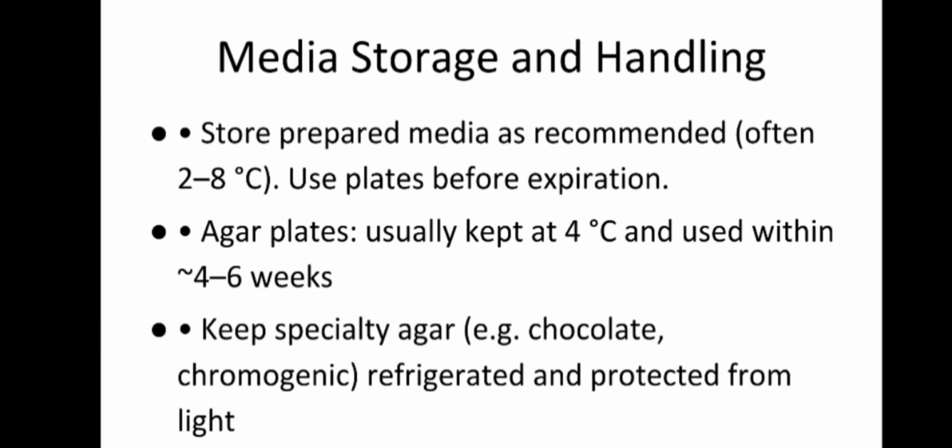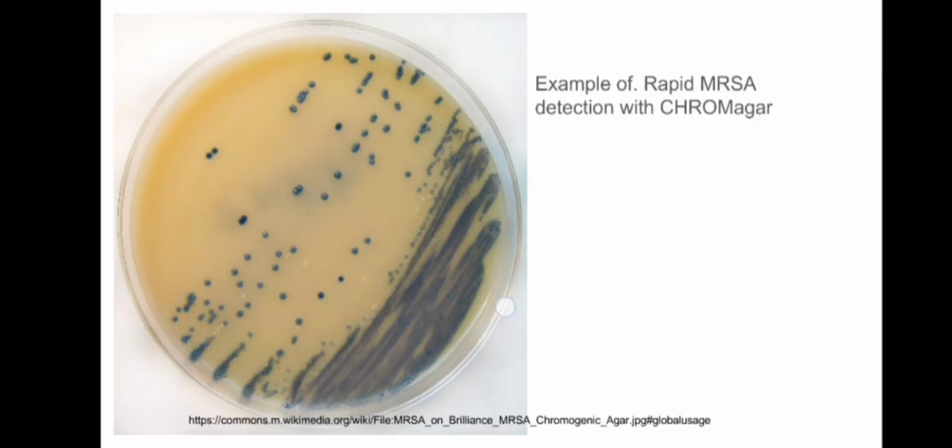But it is recommended to do it on a very fresh plate. If moisture is not there, whatever inocula you press into the bed is easily absorbed into it, and so we get good colonies like you see here.